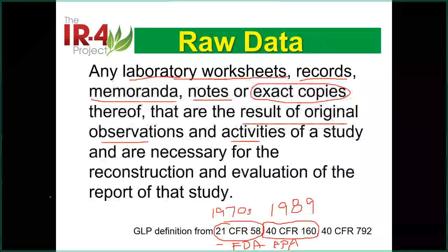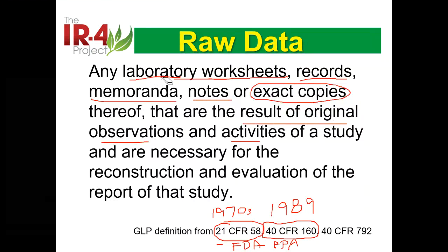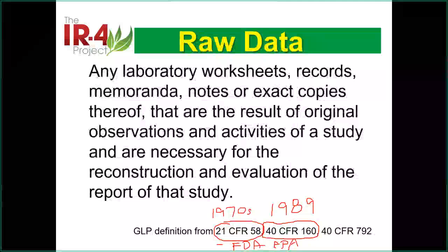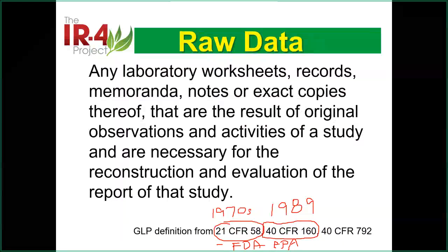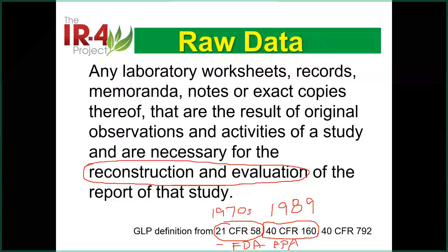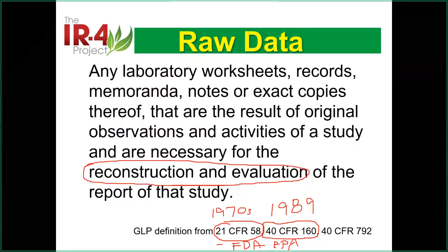And all those, well, what we can tell, the keyword here is you need to have all the data to reconstruct your work, to evaluate your work. So everything you need to do is make sure I can go back to see exactly what you did. So if something happens, and you need to go back, oh, what is the previous step? How is this leading to here?